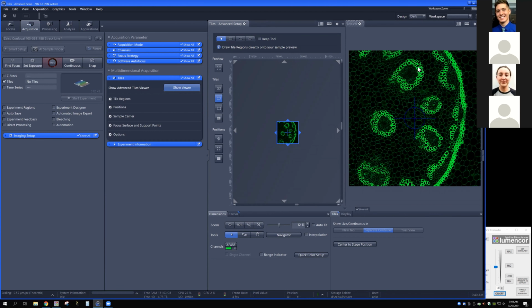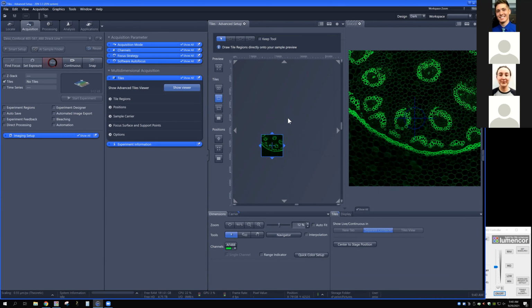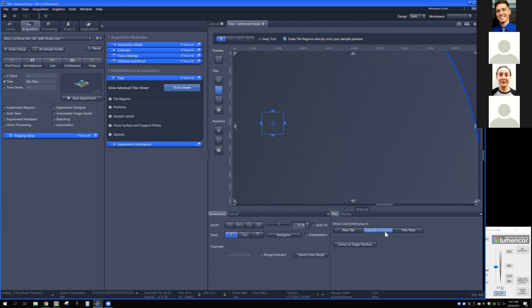But again, we can just do that over here in the live view. And you can double click here to be able to make big jumps, which I think is really quite helpful. So lots of different ways you can navigate. After using this for quite some time, I highly recommend that separate container, and using this when you need it to bail you out is very, very helpful.